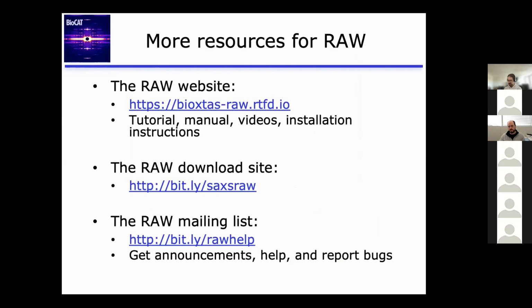Great, thank you. From all the options, it sounds like this is a question that you've run into before. Yes. A lot of people want to know how to plot their data. And you can save the plots directly from RAW, but there you can't adjust the size or adjust the DPI. They're not made for publication. They're just if you want to show it to someone easily. So remaking figures for publications is definitely a common problem.